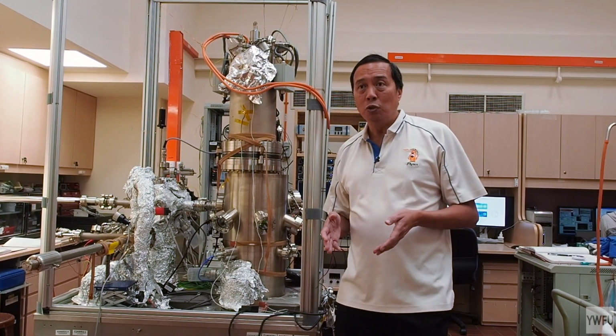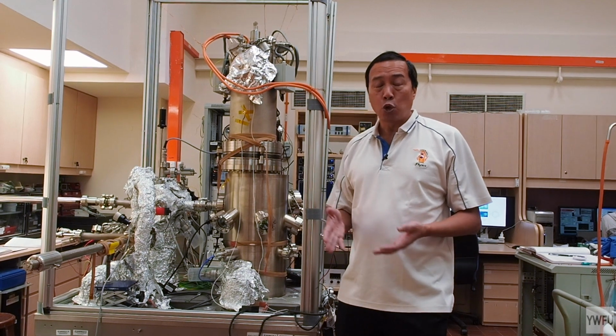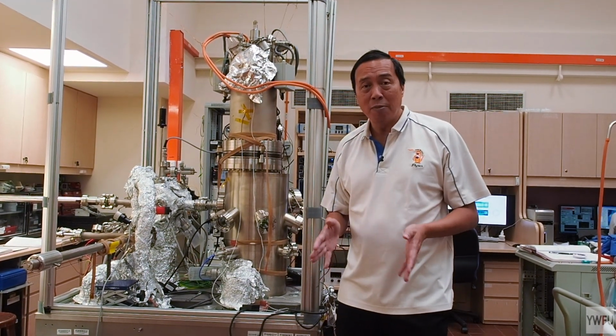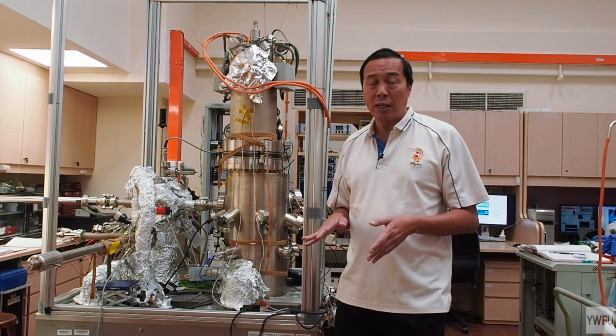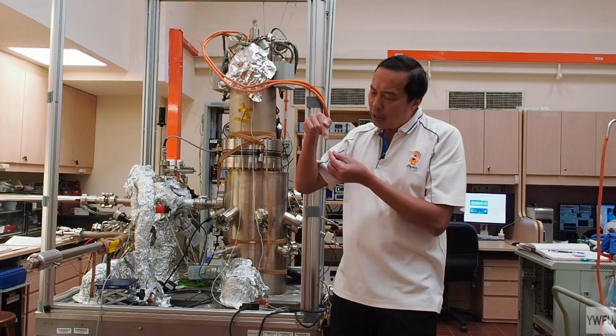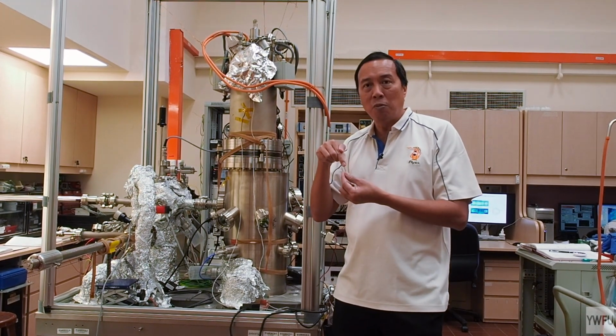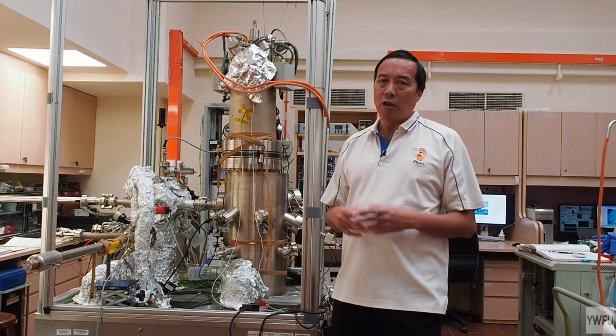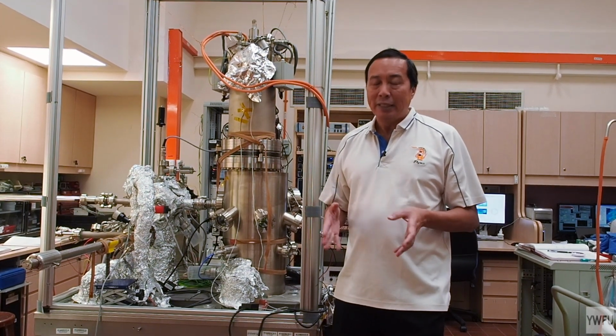Firstly, we need liquid helium to cool the whole system to 4 degrees Kelvin. That's very near absolute zero, in order to stabilize the system. Secondly, we need to modify the tip and put one single CO molecule on top of the tip, and then we scan the image. That's why it's a lot more difficult to do AFM than STM.